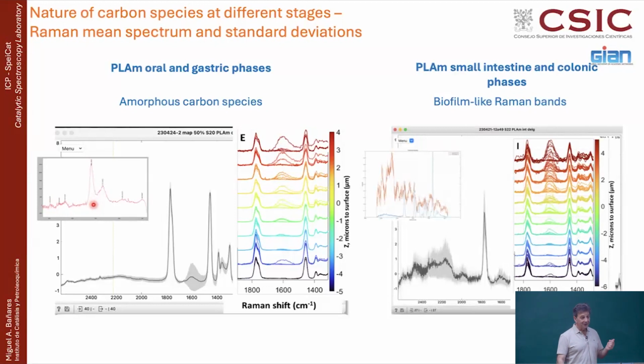This is not catalysis, true, but you can try to do these kinds of things in catalytic materials. I couldn't find a good example, but examples will come anytime now, because you are dealing with shaped catalysts, you are dealing with pellets, you are dealing with porous materials of given shape, and you can do these kinds of things. We want to do these things, and maybe next time I visit you, I can show you these kinds of applications for catalysts. But this is something doable.